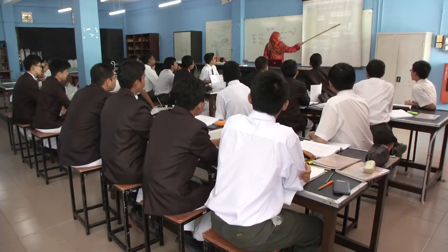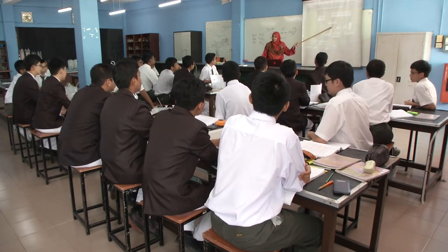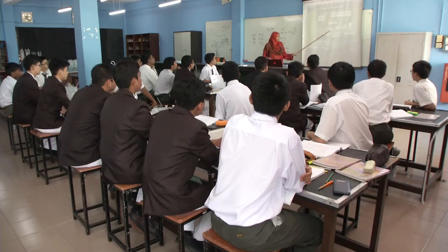But you do not have a measuring cylinder in your list of apparatus, because the chemicals have already been prepared for you. And then you have how many beakers in your basin? Three, okay. One is for the formation of the insoluble salt. The other two you use for filtration.